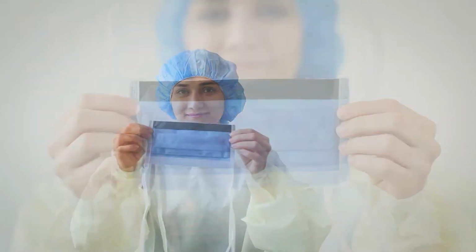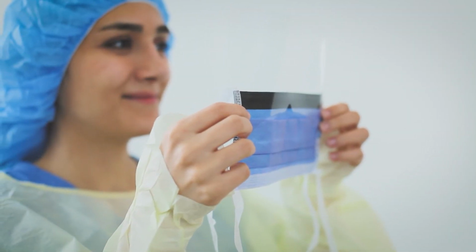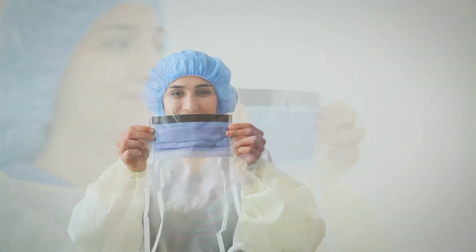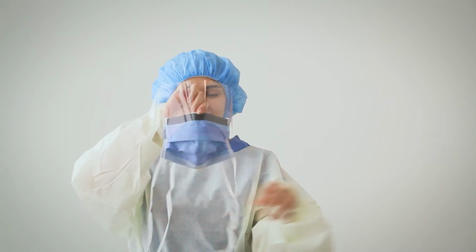Hold the mask with the outer layer out and pleats folding down. The outer layer is usually colored and should be away from your face when donned. Bend the nose piece and pull to open the pleats.